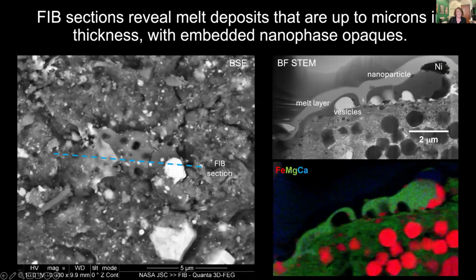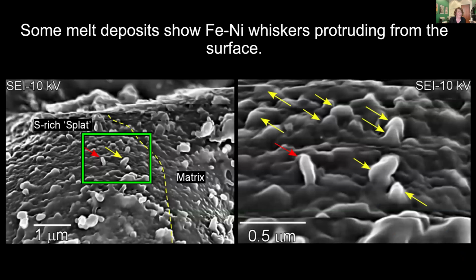All of these bright areas are vesicles that are formed through outgassing of volatile species like the water that we see in these hydrated mineral phases in the sample itself. We also see these dark Dalmatian spots or nanoparticles that are distributed throughout the melt itself. And we can see that those nanoparticles are enriched in iron, as well as in some maps, we've got nickel as well as sulfur. This is interesting because most of the nanoparticles we see in samples from the moon are just iron metal. And here we have nickel and sulfur playing a role, which is going to influence how they affect those spectral or optical characteristics that we can observe for asteroid Bennu.